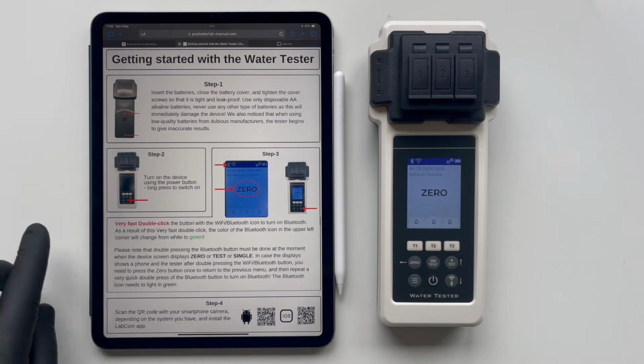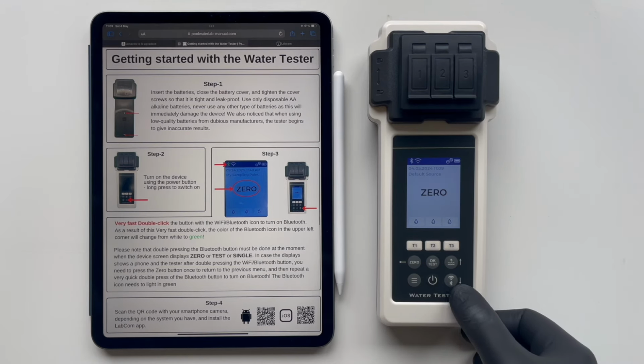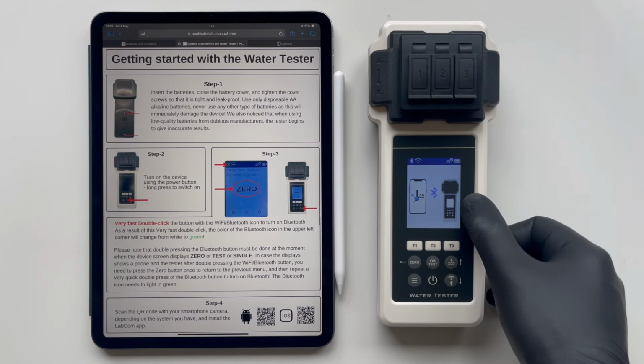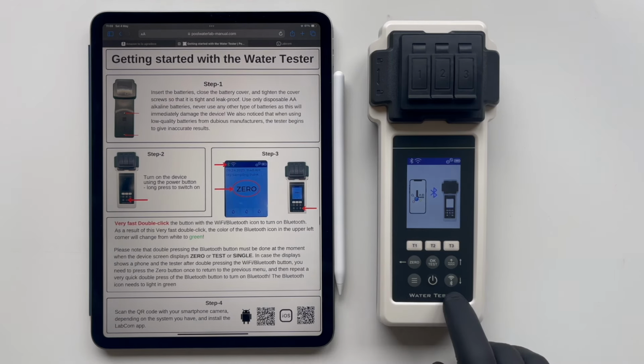Now, we need to proceed to the third step, which is to turn on Bluetooth. This is done using the Bluetooth button. You need to quickly double-click this button. Let's try it. We press the button, and as a result, on the tester's screen, we see an image of a smartphone and the tester. This means that Bluetooth is not enabled. We didn't click quickly enough. This means that the action required a faster double-click than we performed.